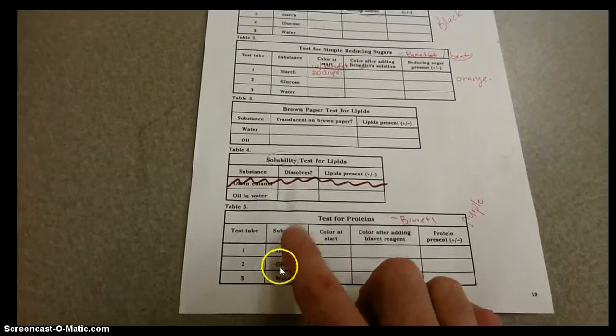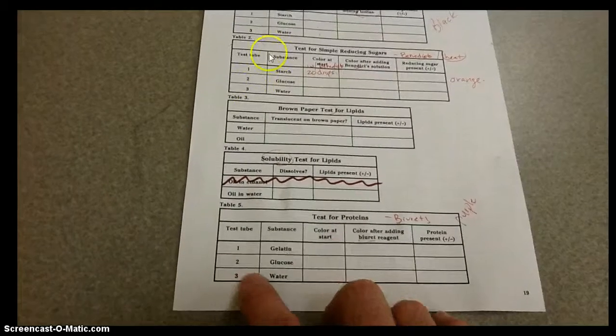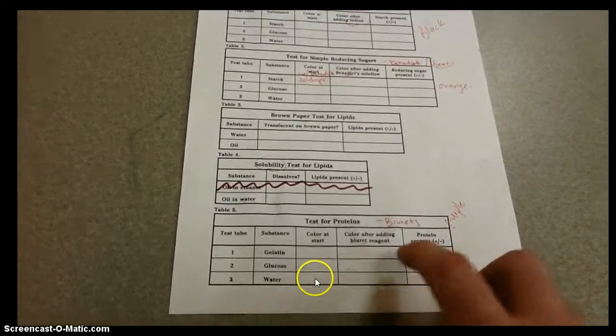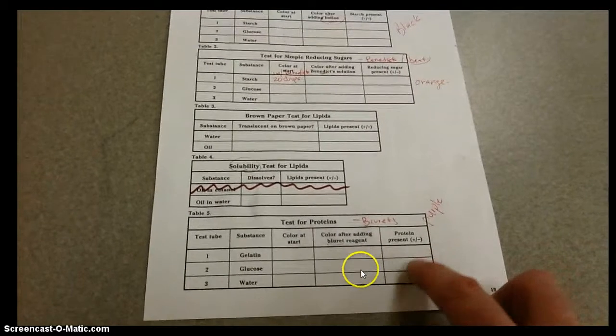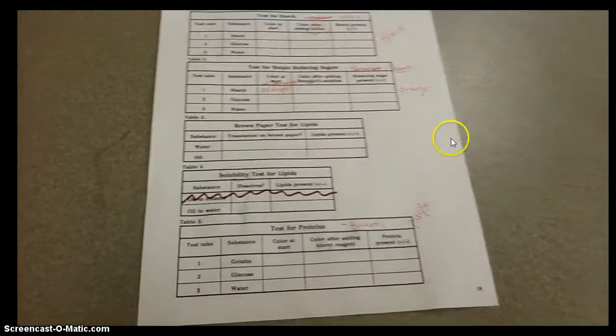And the last one, going back to our 3 test tubes, cleaned them out. Test tube 1 is now going to be gelatin versus our starch. 2 is glucose, 3 is water. What's the color at the beginning? We're going to use biuret solution, and then if it turns purple, it is positive. Remember that we do not heat this one.